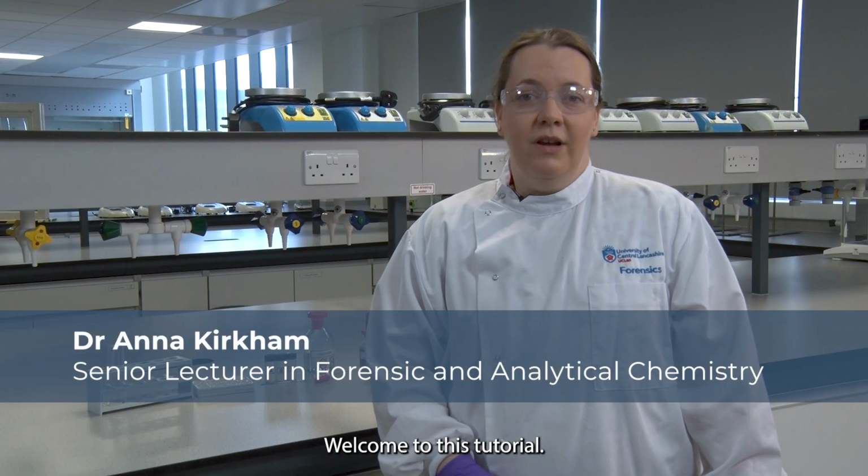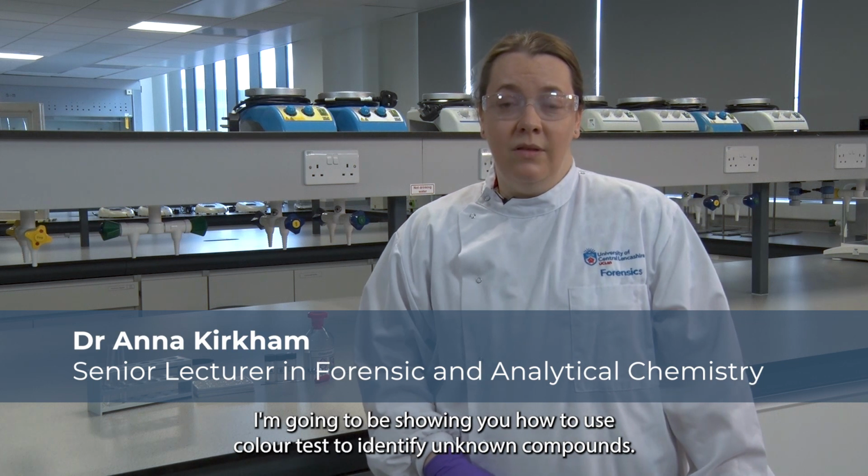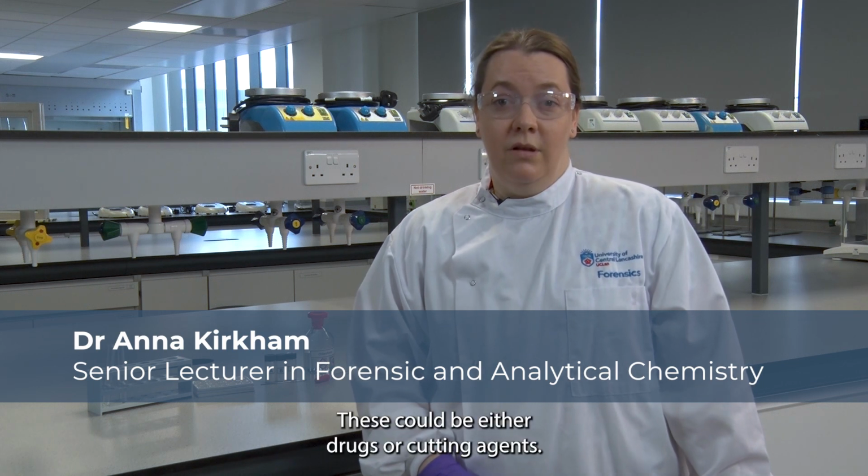Welcome to this tutorial. I'm going to be showing you how to use colour tests to identify unknown compounds. These could be either drugs or cutting agents.